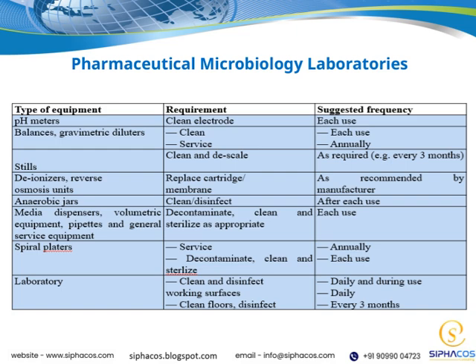Overall, pharmaceutical microbiology laboratories are a cornerstone in the manufacturing process, helping us uphold the highest standards of safety and quality in our medicines. Their work supports the entire pharmaceutical quality system and protects patient health.